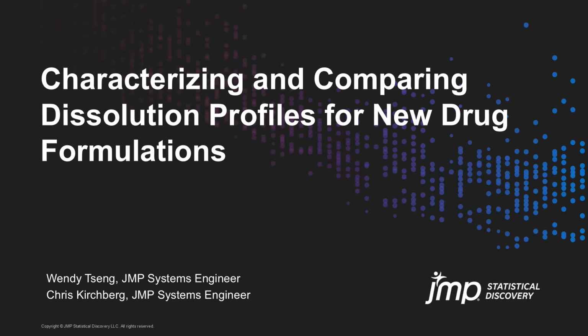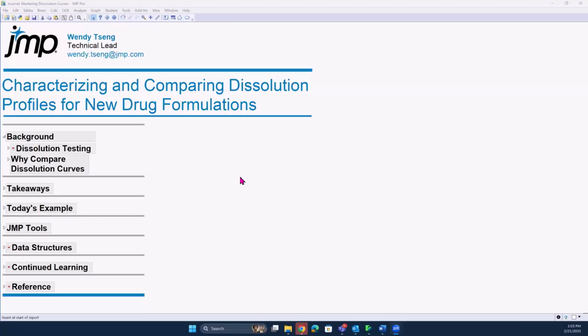So this is a very specialized topic, and I'm assuming you guys come from the pharmaceutical space, and this is a topic that's very familiar to you. But in case you are here simply to learn, I want to spend a couple minutes talking about what dissolution testing is and why we want to compare and characterize dissolution profiles.